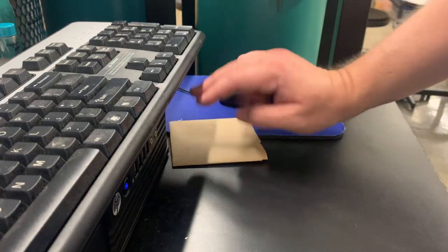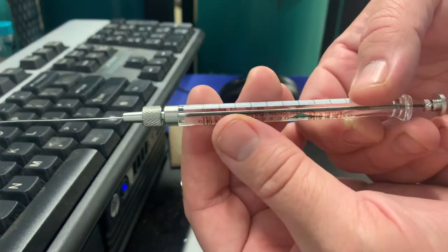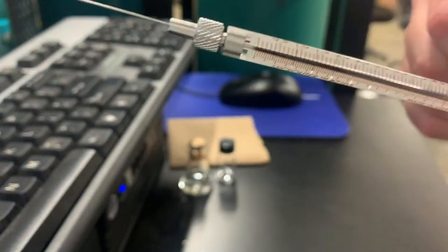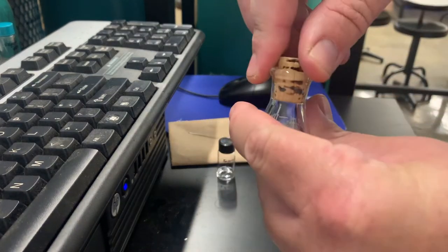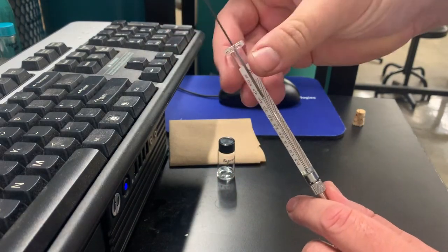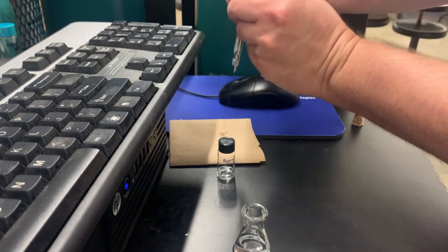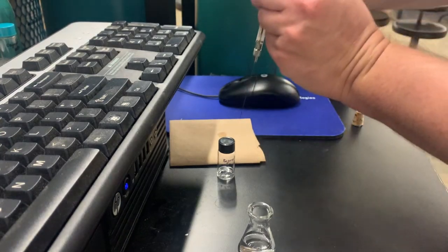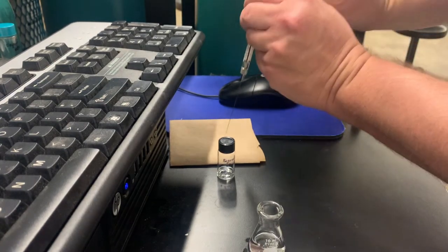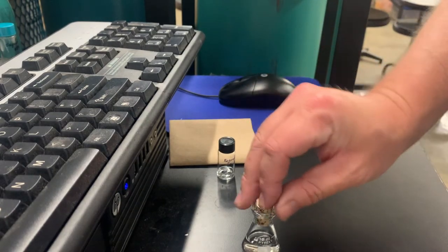Okay, so what we're going to need is a paper towel, some clean diethyl ether, our sample, and a 5 or 10 microliter syringe. We want to add 1 microliter, and so we want this relatively small. Now to do this, we want to start off by washing our syringe, especially if somebody used it before you. To do that, it's just going to suck up a few times some ether straight from here, and just shoot that out. Now we're using ether because that was our solvent for our compound here. So same solvent, and now we're done with this.